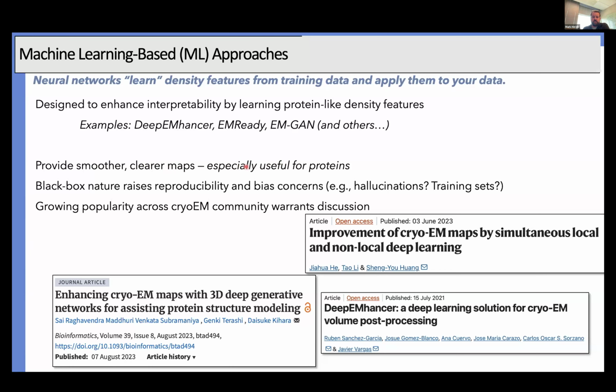Now, one of the things that we want to highlight and emphasize here is this has been in our group especially useful for proteins and protein complexes. And I think that, as I'll highlight later, is a result of how these algorithms were trained and built. Because the EMDB is mostly protein at this point compared to lipids or nucleic acids and those other ilk.